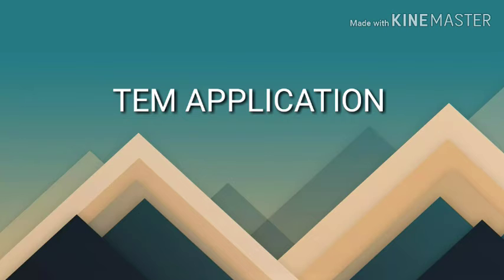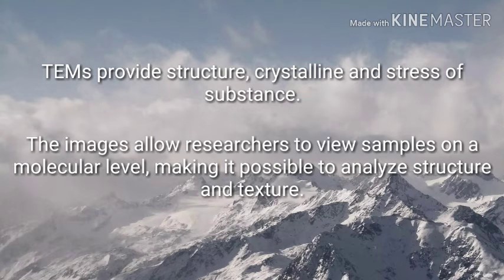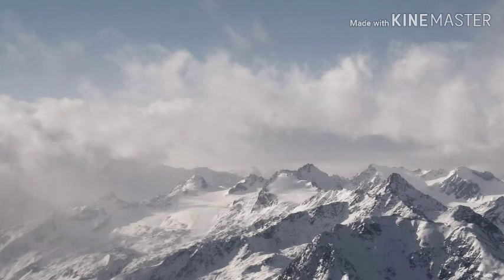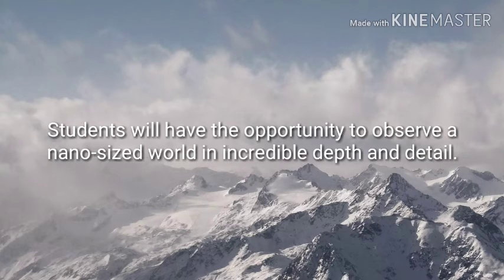TEM application. TEM provides the structure, crystalline nature, and stress of a substance. The image allows researchers to view a sample on a molecular level, making it possible to analyze structure and texture. TEM can be used in semiconductor analysis and production and in the manufacturing of computer and silicon chips. Students will have the opportunity to observe the nanoscale world in incredible depth and detail.